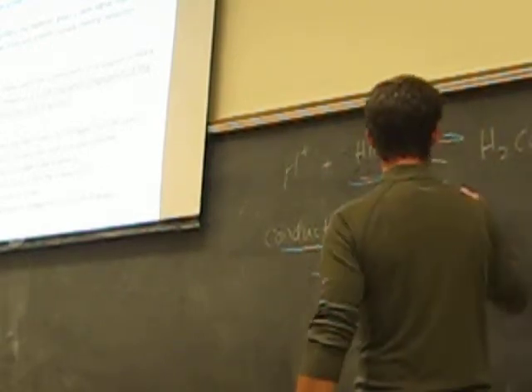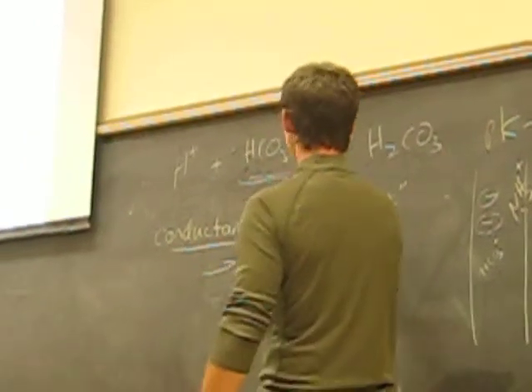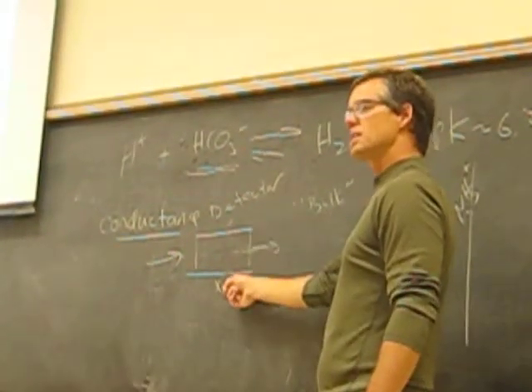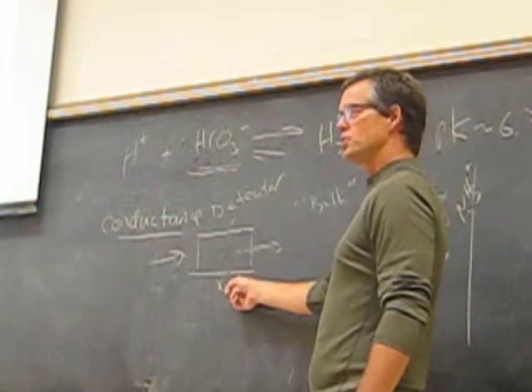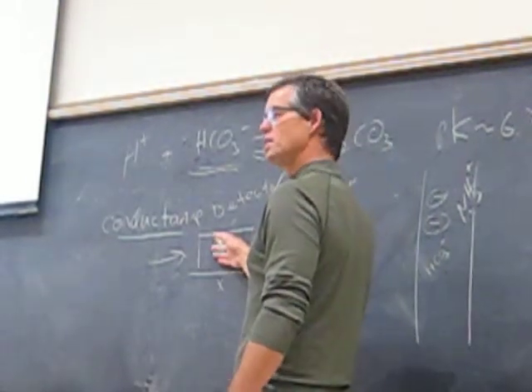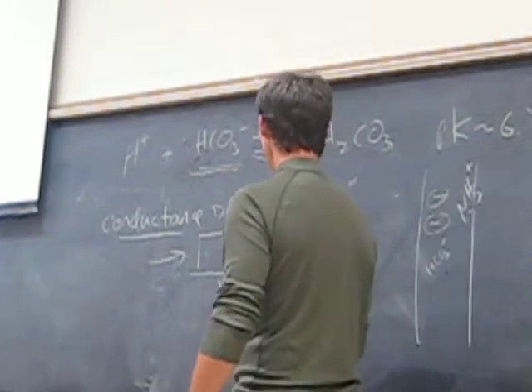And so the problem with these detectors, and the reason that a suppressor is needed, is that they're considered to be bulk detectors. And bulk means that it's measuring the bulk conductance of a current across those poles in the detector, and it's not specific for any particular anion or anything. It's just basically measuring the extent to which that solution can conduct a current across.